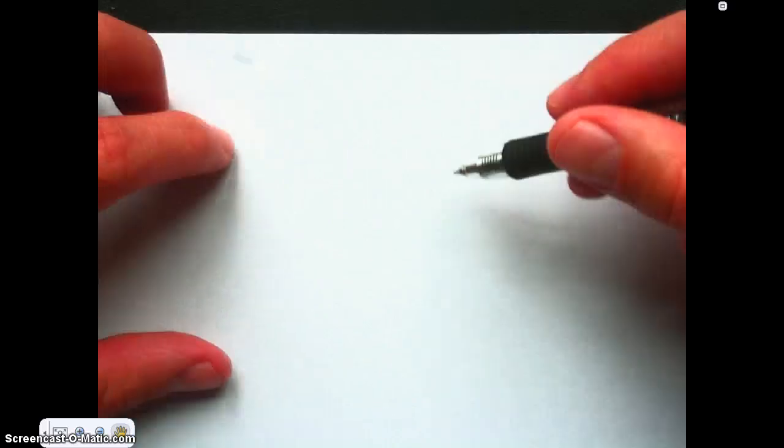Now, when thinking about what you're going to do, I want you to understand that you have to show me, both in a qualitative and a quantitative way, how you are going to show that osmosis and diffusion is occurring. The first thing I'm going to give you to use is a piece of what feels like plastic, as you'll see, and it's called dialysis tubing.